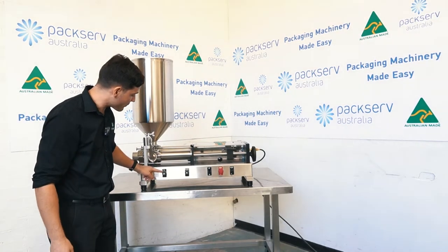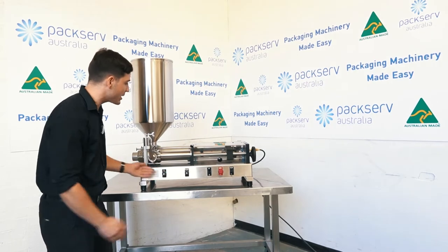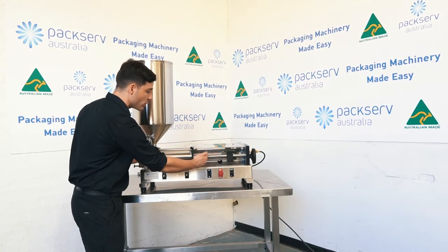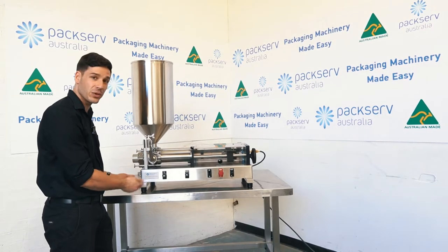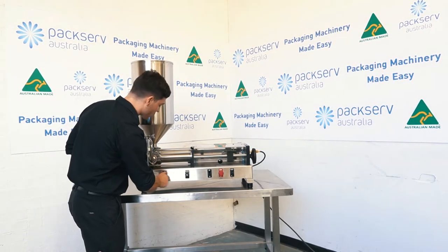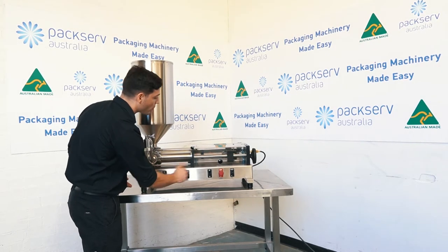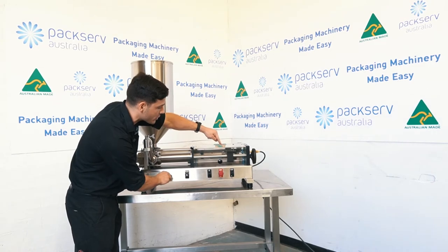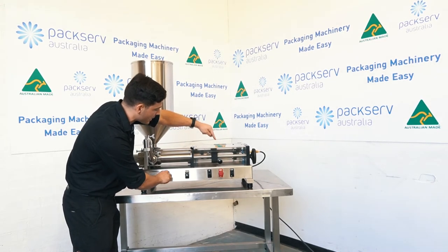Here at the front we have the fill speed. It has variable speed on this machine. The fill speed is how quickly this piston head is going to move forward — essentially this dictates how quickly your product is going to enter your container. If I flick this on and spin this fill switch completely clockwise, it's going to run really, really slow. And then as I open this up, it gets faster and faster.